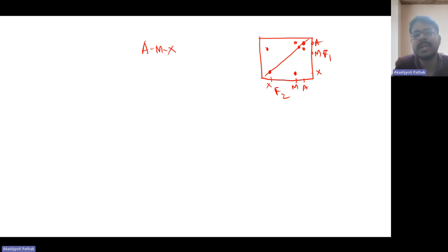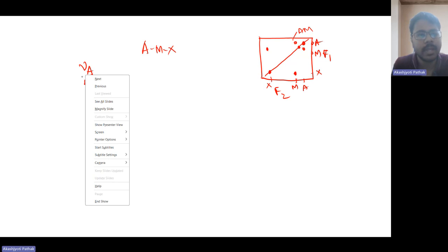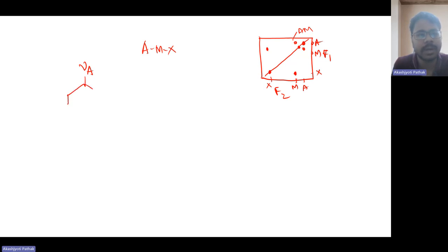Now, for example, you are considering this AM cross peak. If you consider the AM cross peak, first you will see how the splitting of the spectra of the A spin takes place. The A spin will be split into two because it is coupled to M, and we are considering the AM cross peak. So the M spin will cause the splitting of the A spin into plus and minus. This is JAM, the coupling constant between the A spin and the M spin.